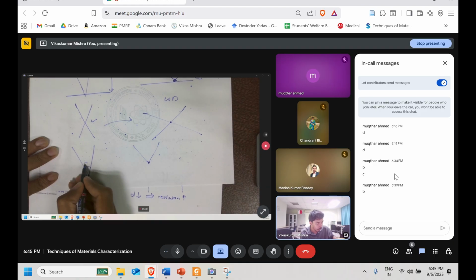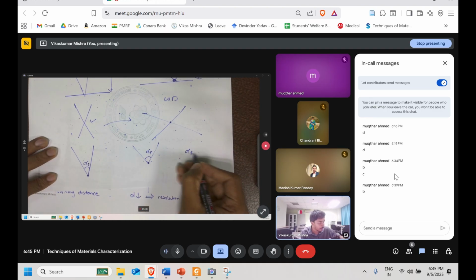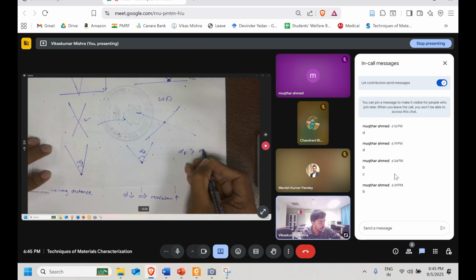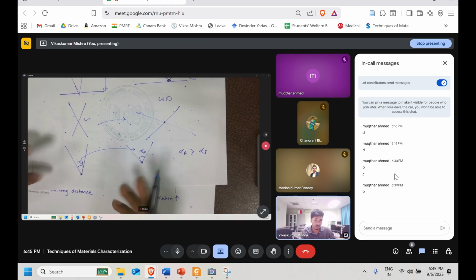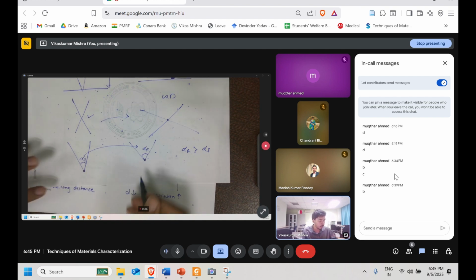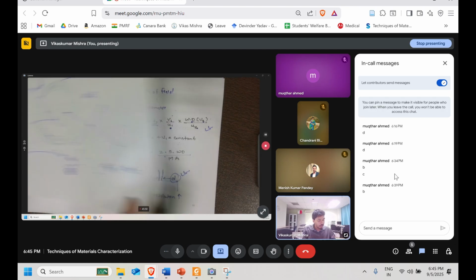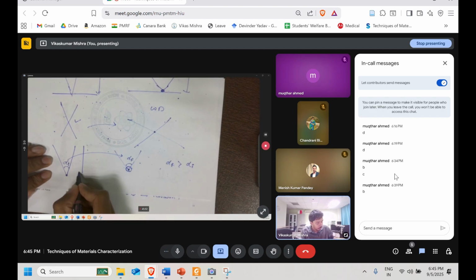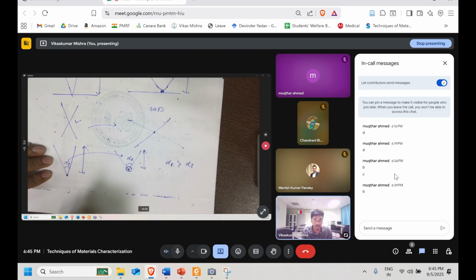So this alpha, let's say alpha i and alpha f. What is happening is that alpha f is increasing, greater than alpha i. So we keep on increasing the angle, we keep on strengthening it. We are trying to condense the electron beam more and more. And if this was the height at which it was converging, this height will also decrease.